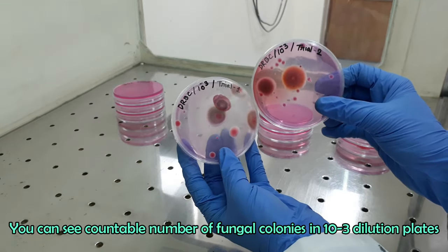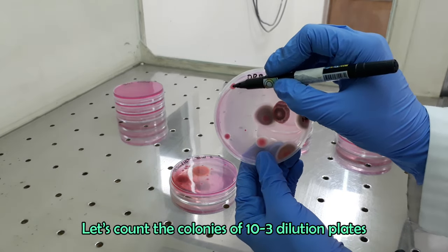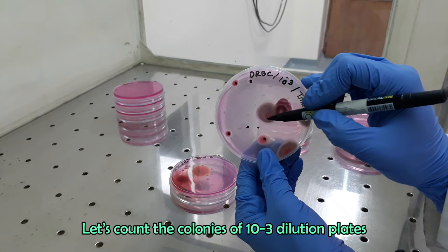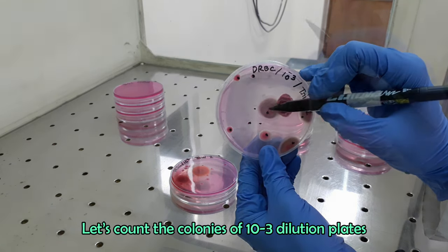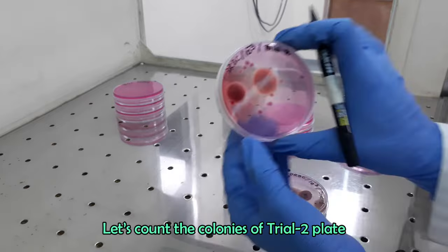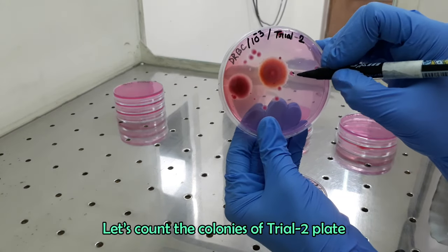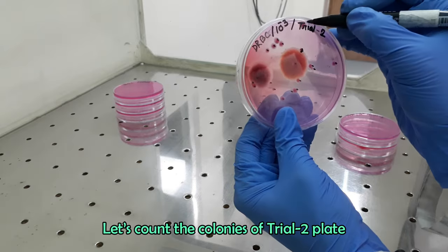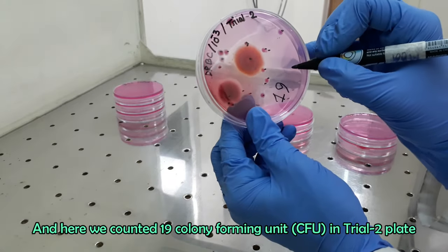You can see a countable number of fungal colonies in 10 inverse 3 dilution plates. Let's count the colonies of 10 inverse 3 dilution. We found 11 colony forming units in trial 1 plate. And here we counted 19 colony forming units in trial 2 plate.